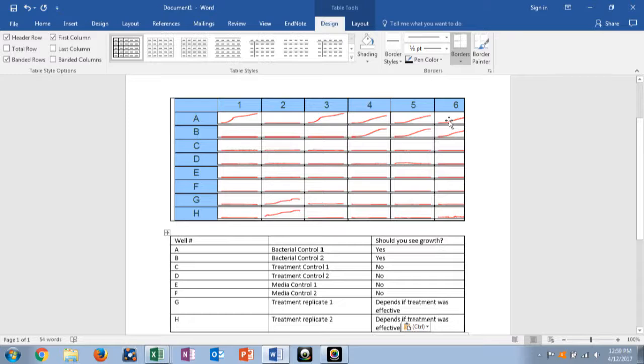If you want all of the conditions for the same 8-well strip, you have to get everything in a group from A1, B1, C1, D1, E1, F1, G1, and H1. For all the conditions for strip 2, you need A2, B2, C2, D2, E2, F2, G2, and H2, and so on and so forth.